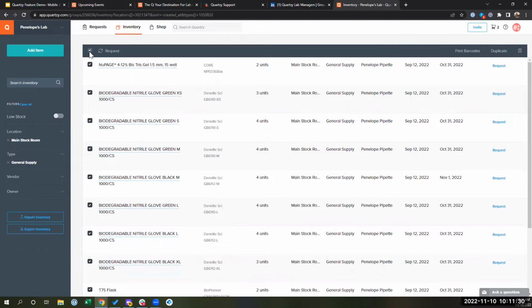Yes, Libby. So we have a question about whether we can generate barcode labels of different sizes and if that's on the roadmap. That is certainly something that's on the roadmap, and I will throw to Chris a little bit more to talk about future directions at the end of the presentation. But right now, the only size that we are supporting is that 2x4 size.